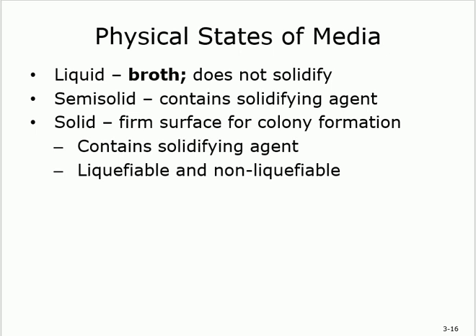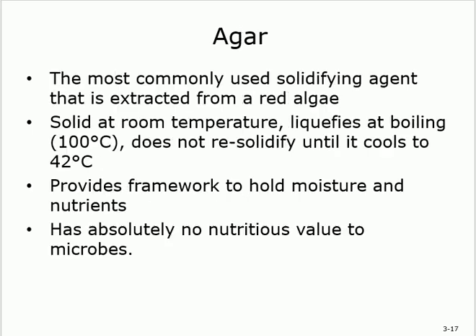So it will make the colony easier. It's a firm surface. Solid can be liquefiable or not. We have different types. This is liquid and that's it. You cannot solidify. This is semi-solid, you can. This is solid, it's already solid, it's firm. But you can liquefy or not. We have different types.